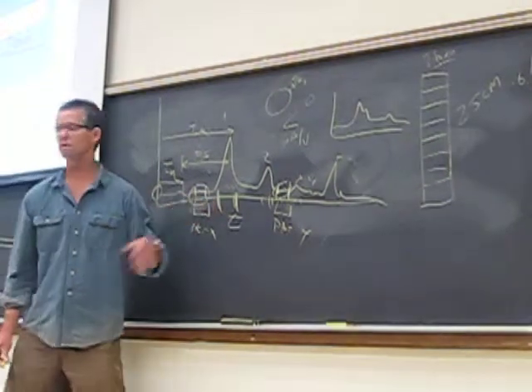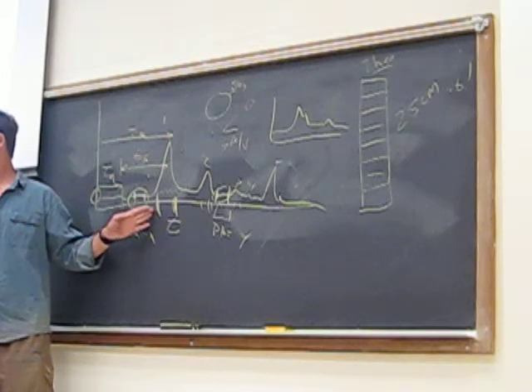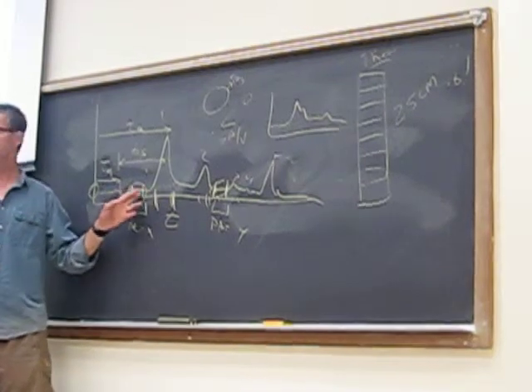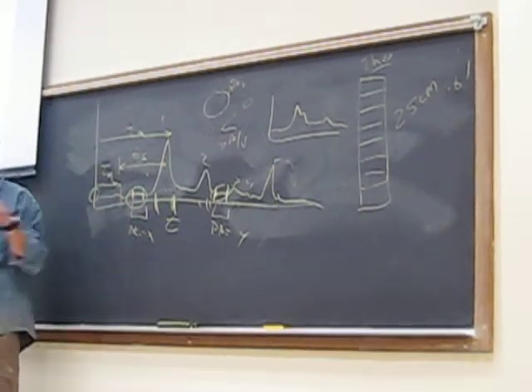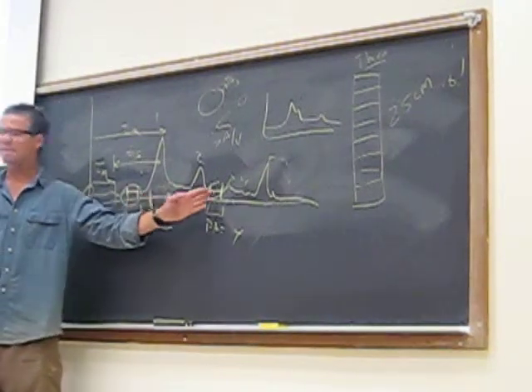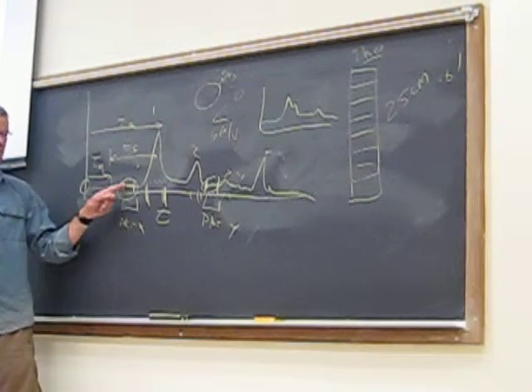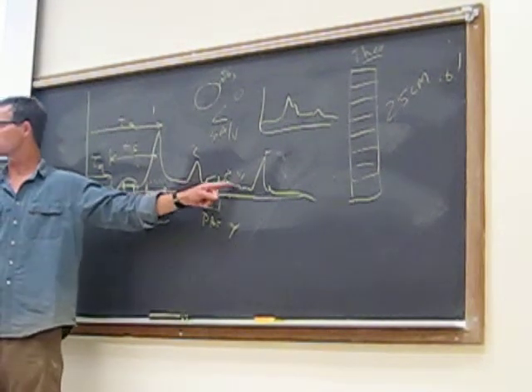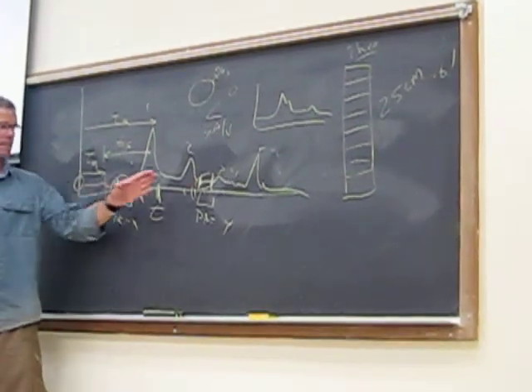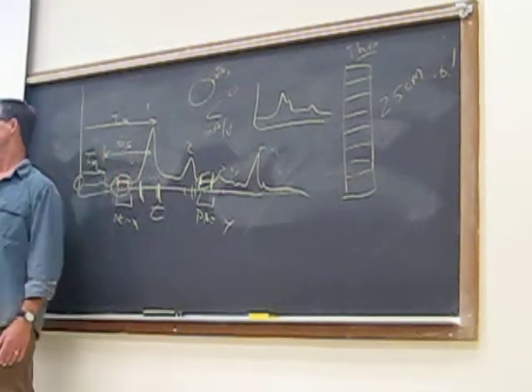Well, if you were trying to derive the baseline noise from a chromatogram where you actually had checked a sample, then you would be looking between peaks where you are certain that there are no analytes eluting, so you'd expand that axis. And you could look at multiple places in that chromatogram where there are no peaks eluting. In principle, the baseline noise should be the same or very similar across those three, right? And so you could say, I'm going to look at these and maybe average those, and I'm going to apply it to the entire run.